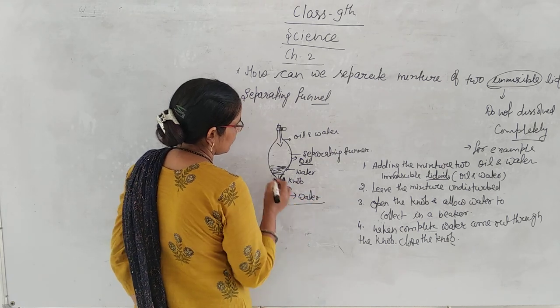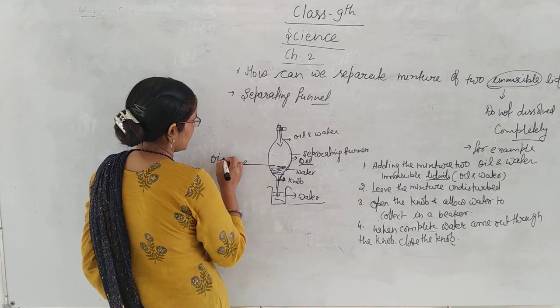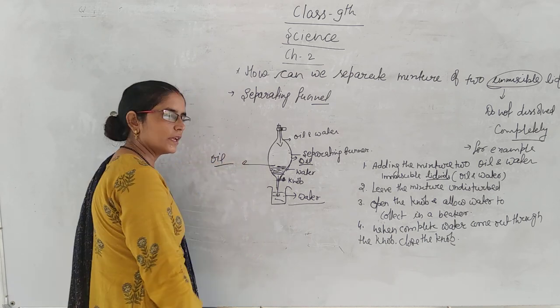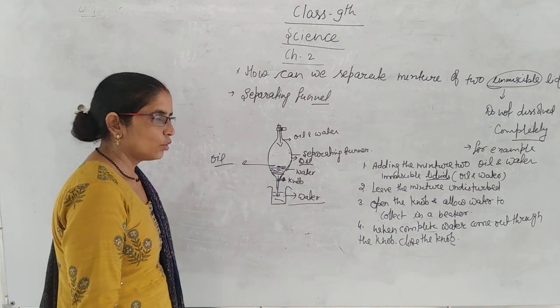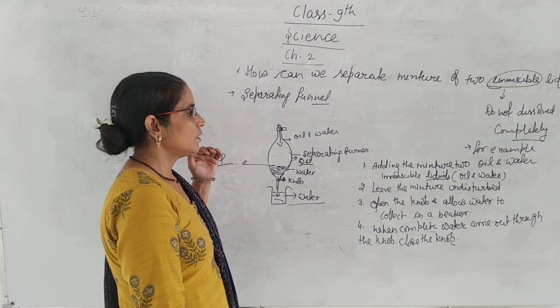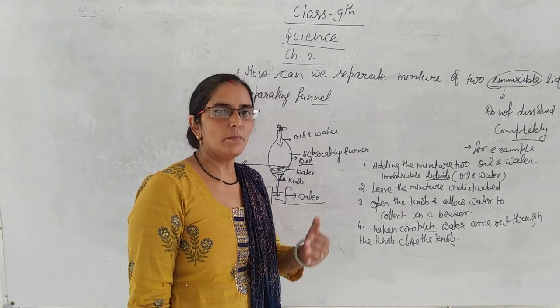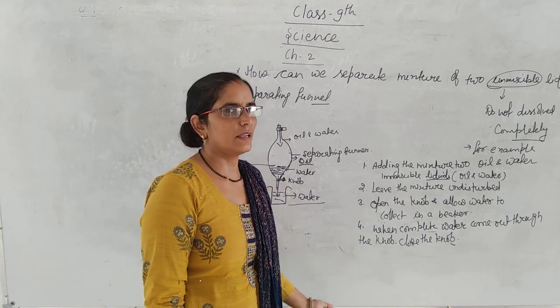In the beaker, we are getting water, and in the separating funnel, we are getting oil. By this method, we are able to separate two immiscible liquids.